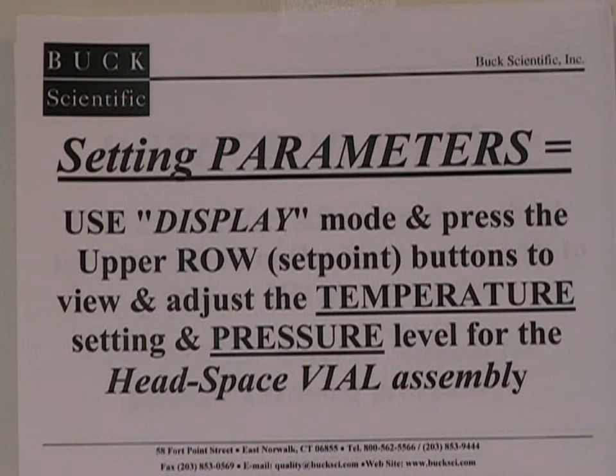While Buck Scientific's Technical Department has preset most of the parameters for you to optimize the headspace analysis with the FID detector, please be aware that individual optimizations may be necessary to get the maximum results out of your GC. Using the display mode and pressing the upper row buttons, which are the set point buttons, you can adjust the vial holder temperature, the valve temperature, and the valve pressure to make sure you get maximum recovery of the headspace volatiles.